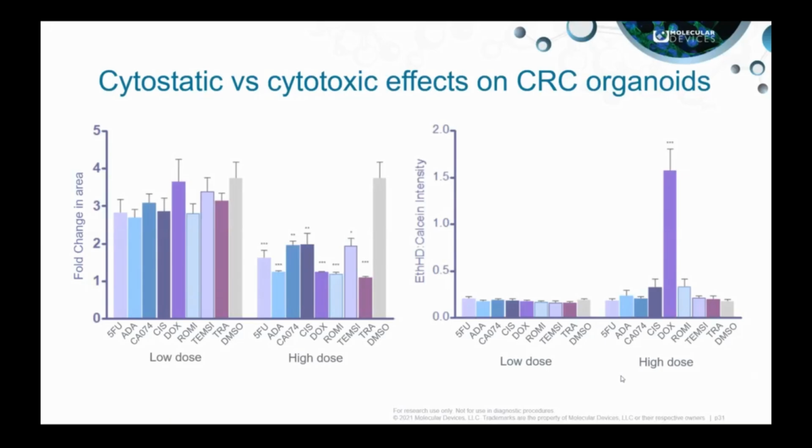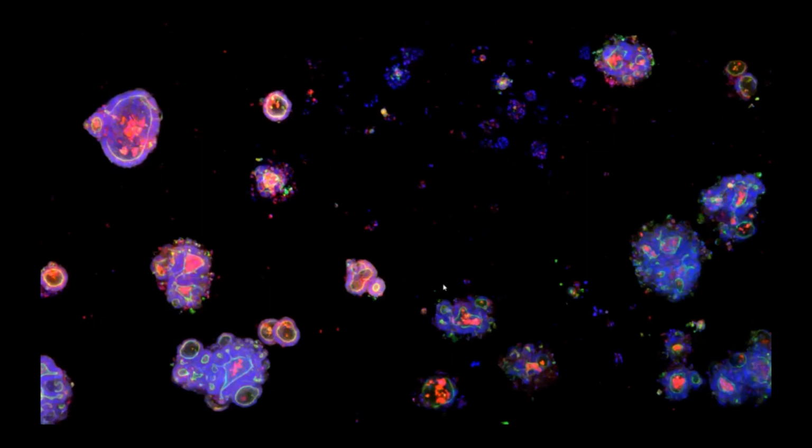Now recall the earlier point I made on why one would take an image-based approach in screening. I mentioned the ability to do phenotypic-based high-content screens. And in this image, again, which is a montage of organoids exposed to various compounds, the red channel represents mitochondria. From this slide alone, I hope you can appreciate the phenotypic diversity that's present. And in the last couple of slides, I'm just going to give a very quick snapshot of the type of data analysis that can be done with such organoid screens.